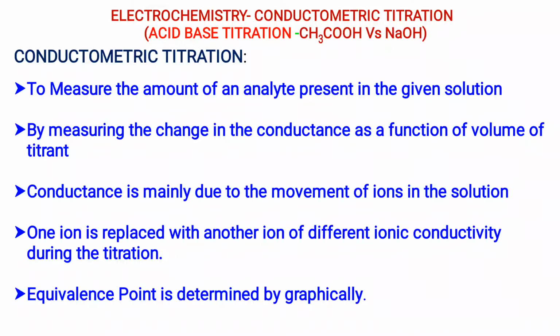Today in this video we are going to discuss the topic of electrochemistry in conductometric titration of acid-base titration, like weak acid and strong base. In the previous video we discussed strong acid versus strong base. Here we can see weak acid and strong base.